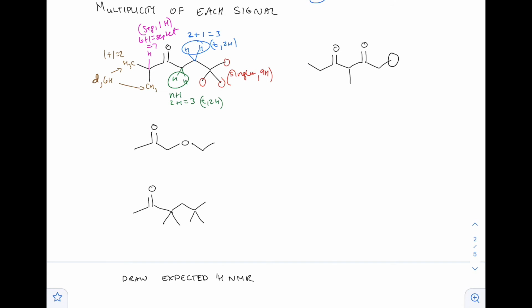This right here sees these 2 protons, so that's going to be a triplet, 3 hydrogens. But because of the symmetry of the molecule, you can see it straight up and down. It's the same thing on this side. So it'll still be a triplet because this still only sees these 2 protons on that side, but instead of 3 protons, it's going to be 6 total because we're counting that side and that side.